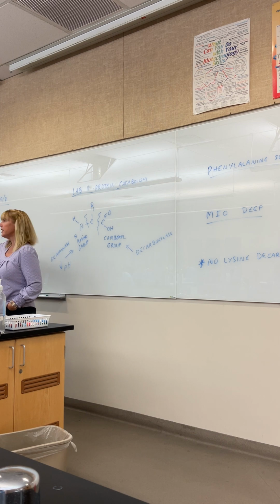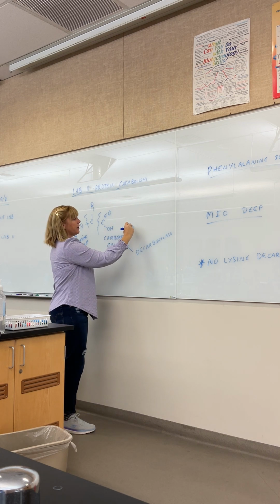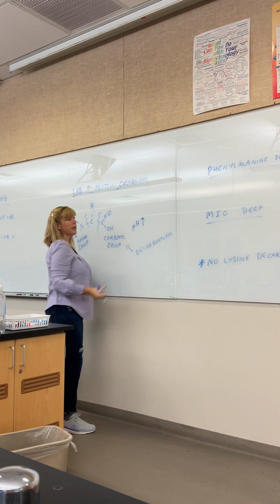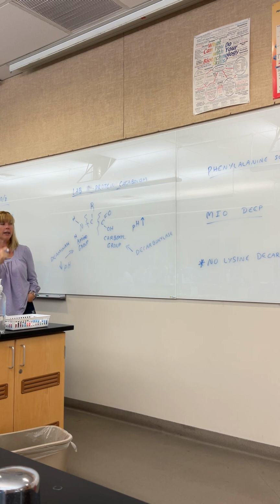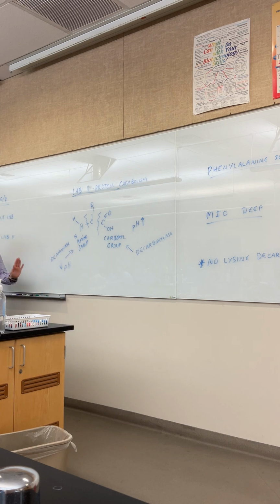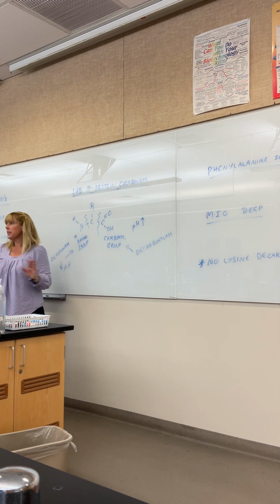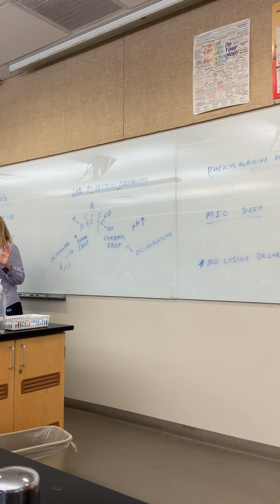What did we learn about our CO2s over there? What did they do to my media, my pH? They went up, yeah. The same is true when I release a carboxyl group. So if I release a carboxyl group, my pH is going to increase, okay? We call that decarboxylase. So as an organism, when I'm living in the environment, I will either produce deaminase or decarboxylase, depending on what kind of nutrients are available and what enzymes I have, okay?